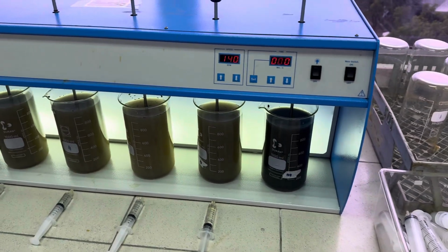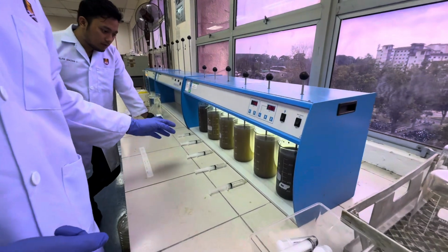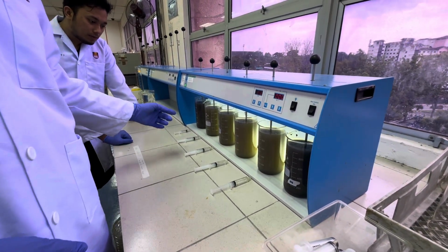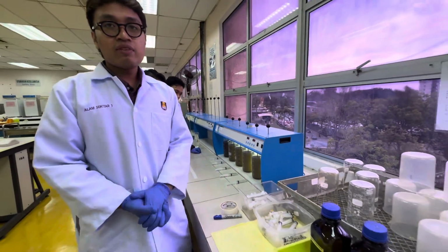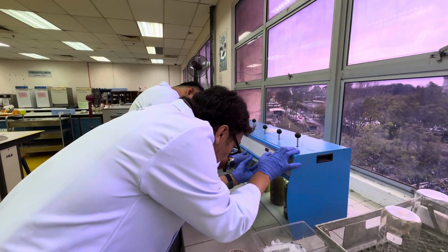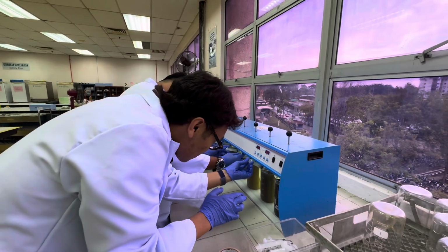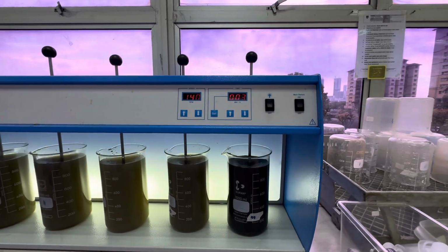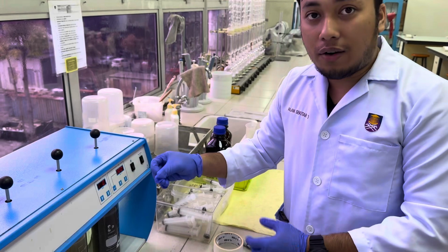So now we are going to conduct the jar test. First, prepare coagulant and sample. Prepare the coagulant at different volumes but for the same concentration. For example, 2 ml, 4 ml, 6 ml, 8 and 10. Start the process and immediately put all the coagulant into the beaker. The timer is set for 2 minutes at 140 revolutions per minute, RPM.